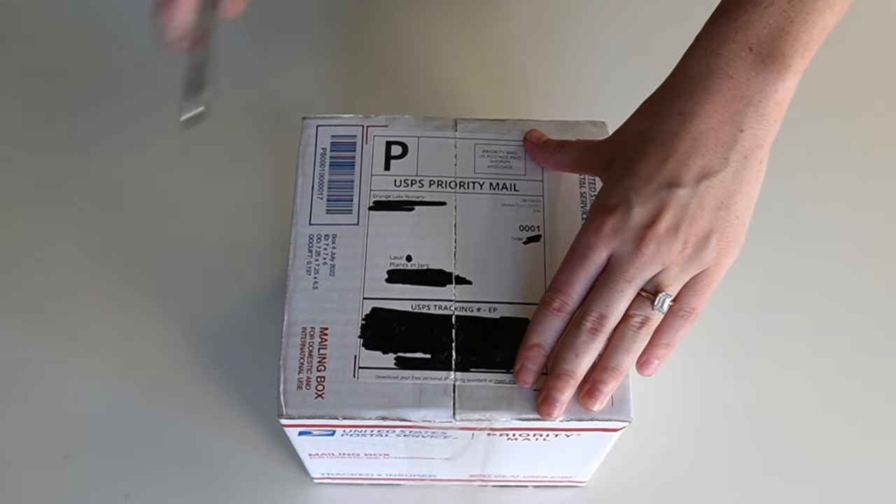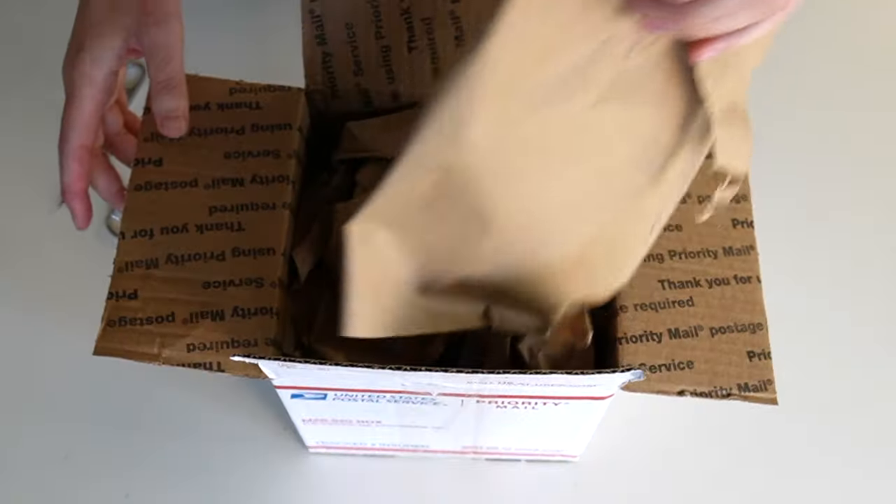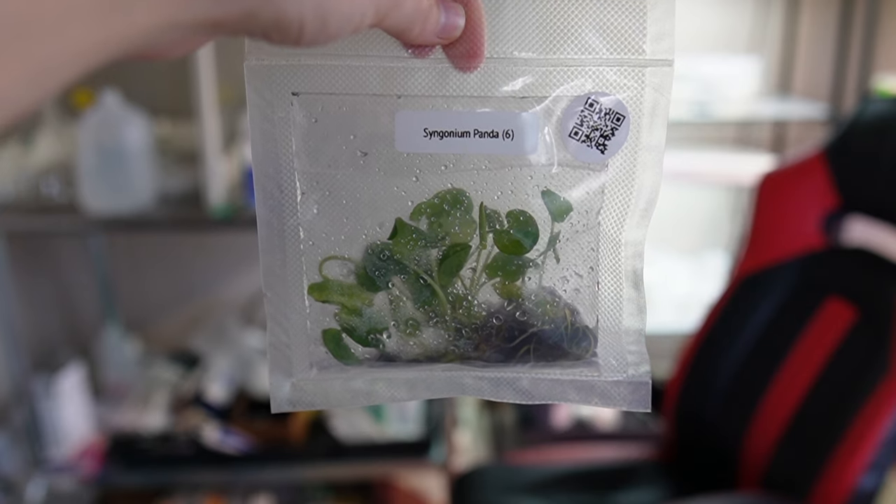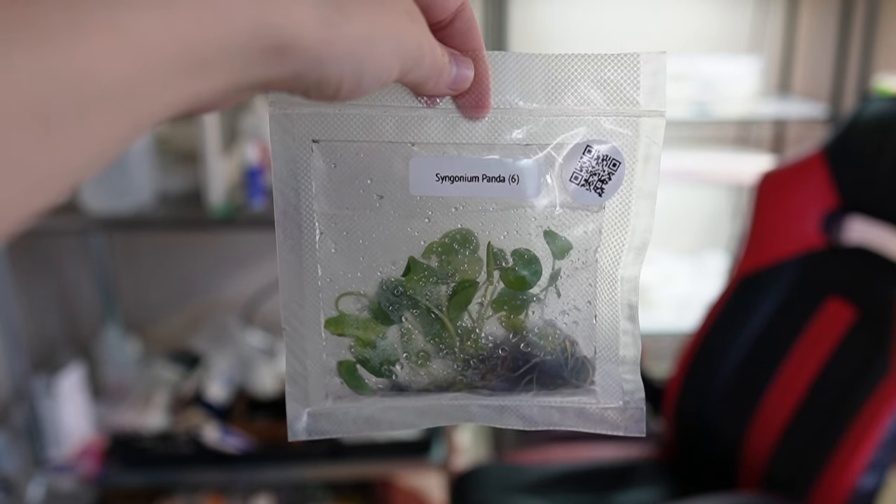When you receive the plants in the mail, you should promptly open the box and remove the jars that contain the plants, or the weird baggie if that's how the plants were shipped to you, like they were in this case. Don't open the jar or the bag that contains the actual plants yet. Once the container is open and the plants have been exposed to the air in your house, you can't reseal the container again and expect everything to be fine because the conditions are no longer sterile and the plants are going to get contaminated and die. So don't open the containers until you are absolutely ready to pot the plants.